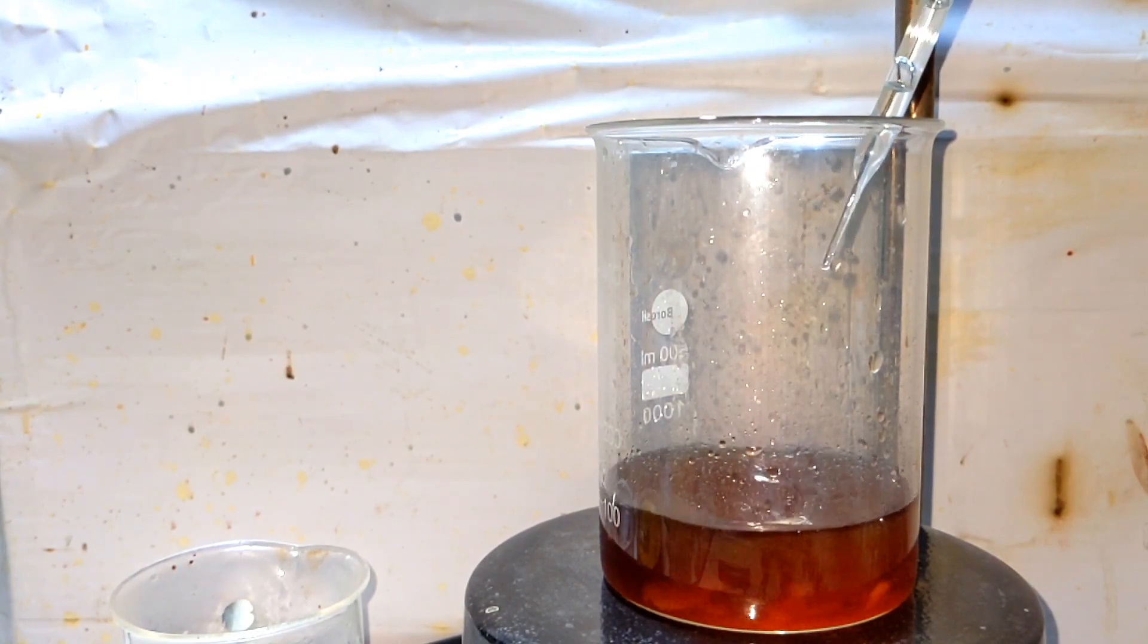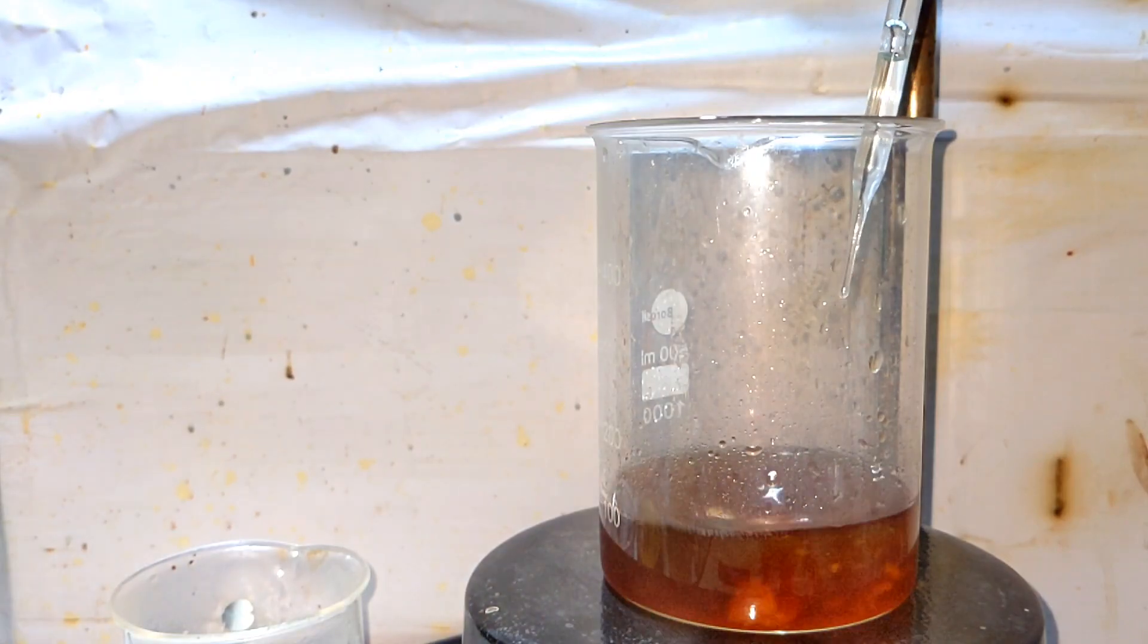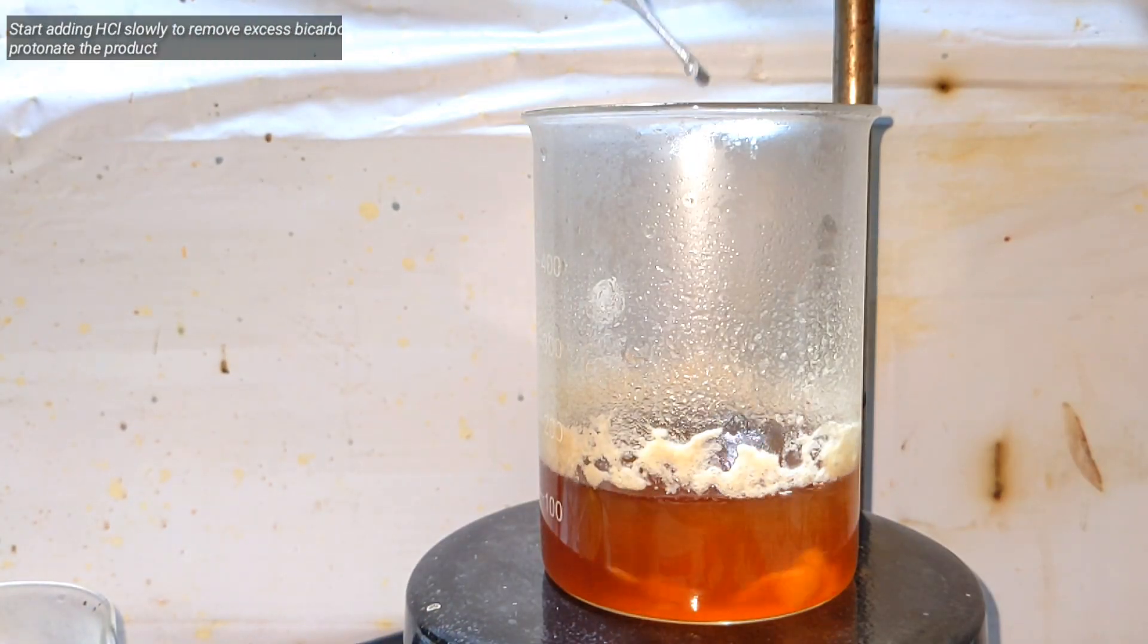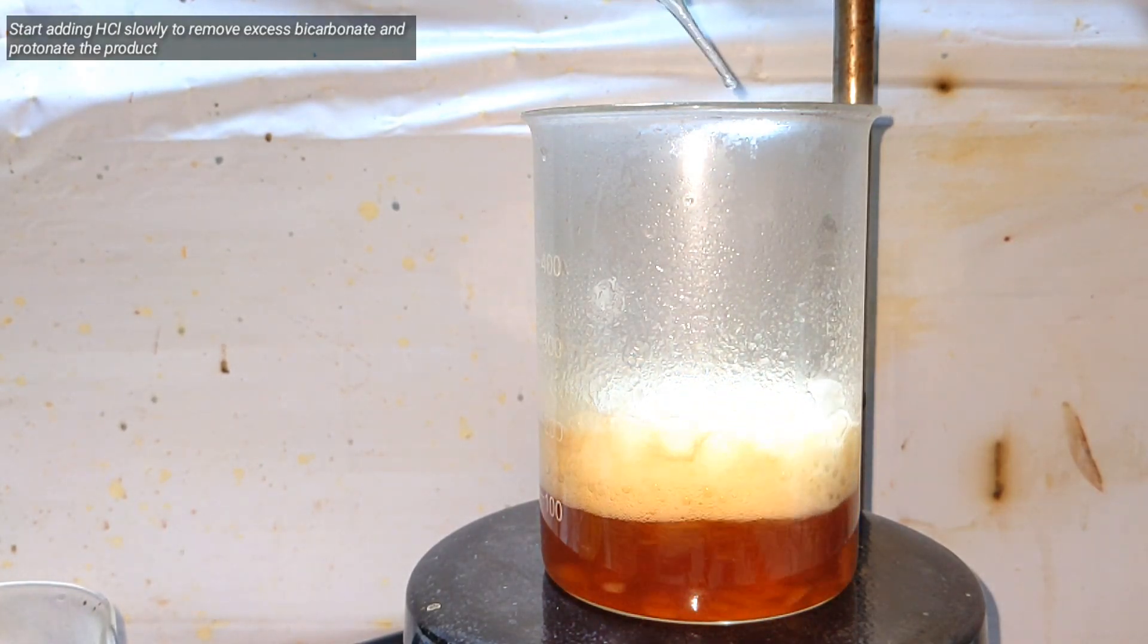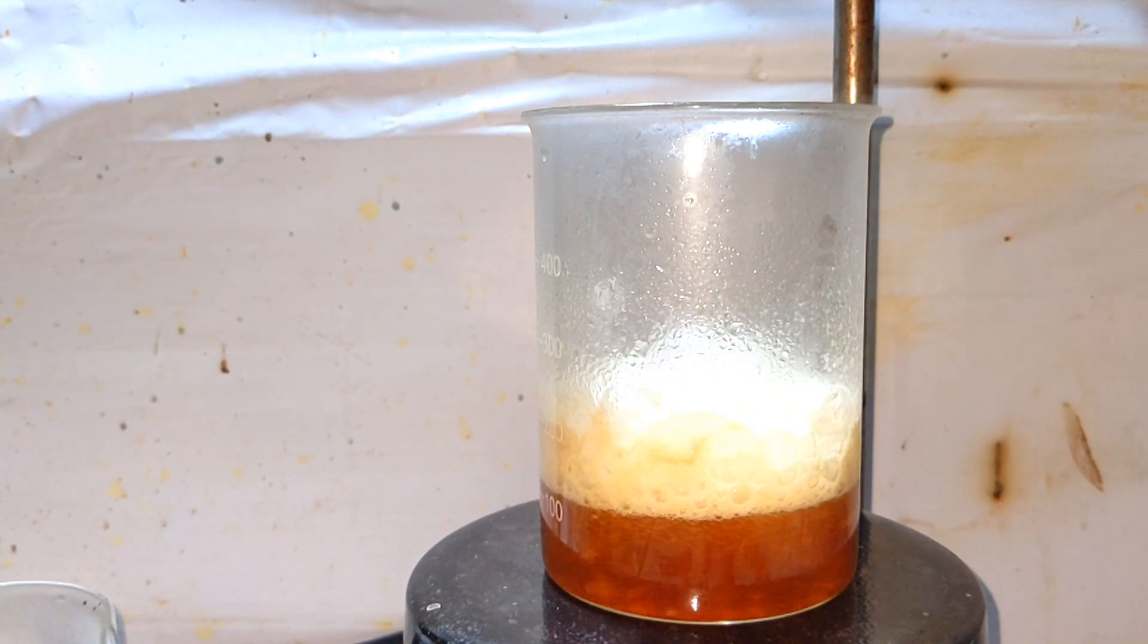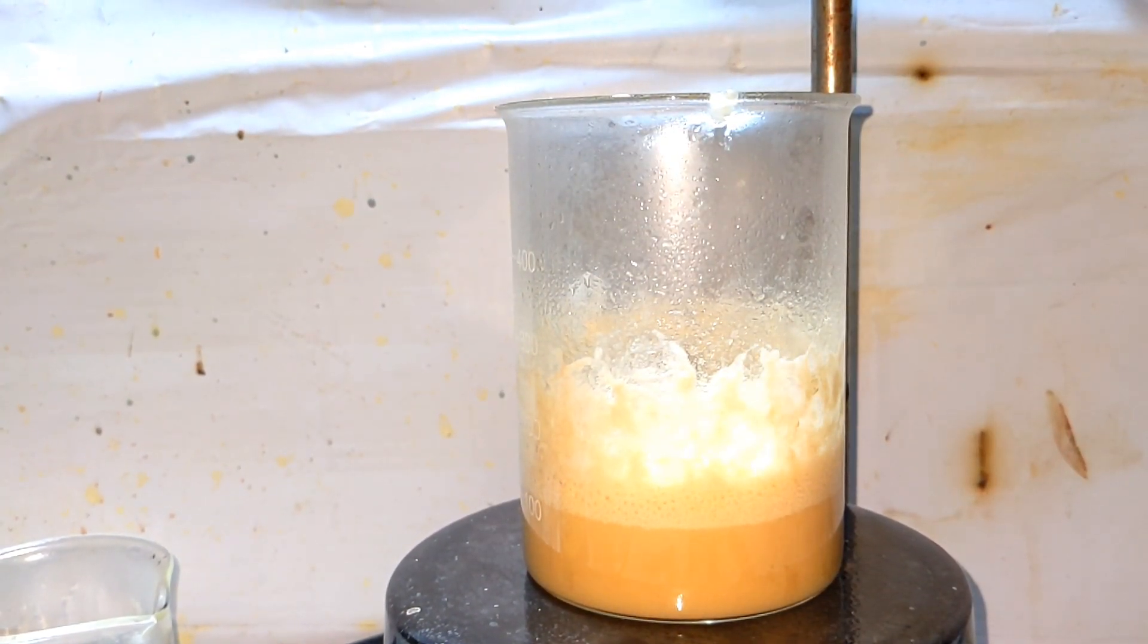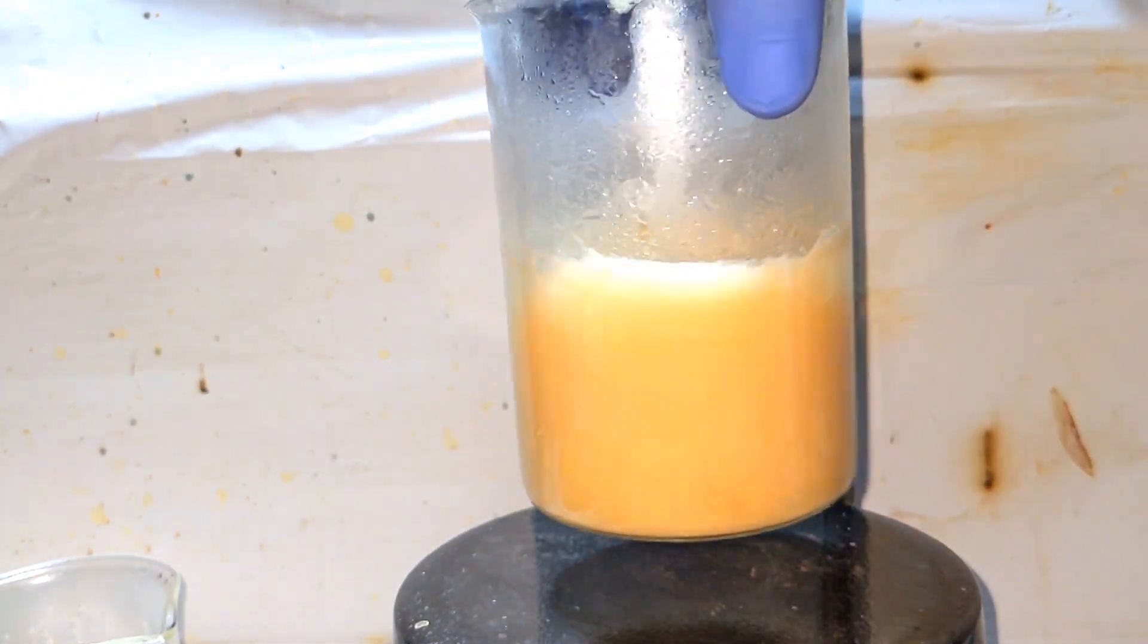This will cause the resorcilic acid to be protonated and the free acid and sodium chloride is formed. Resorcilic acid precipitates out of the solution as an off-white colored powder. The beaker was then placed overnight for complete crystallization to take place.